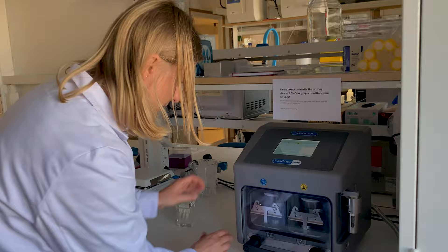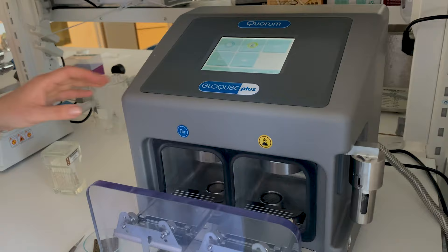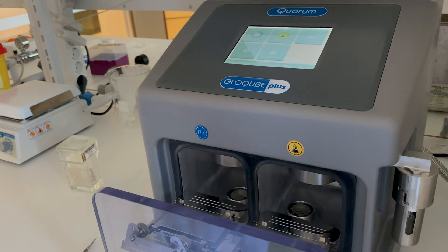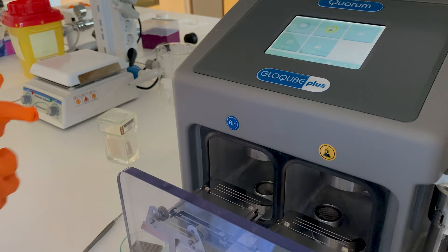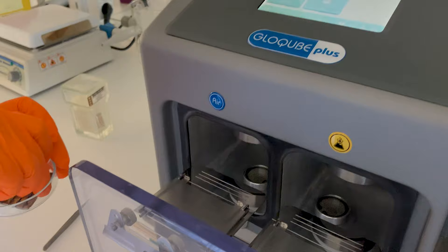Then we open this chamber and pop in the metal tray with the grid. I'm going to do this with gloves on so that I don't contaminate the tray with the grease from my hands. We want to keep everything as clean as possible inside the chamber.